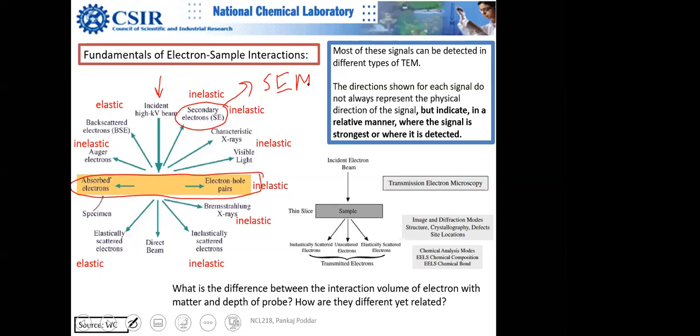Unfortunately, it's not possible because of the scattering cross section. I will not go deep because it's a physics term, but it is very useful. Electron scattering cross section, in layman language, since I would like to use layman language for chemistry students, is basically how much probability there is of a collision.